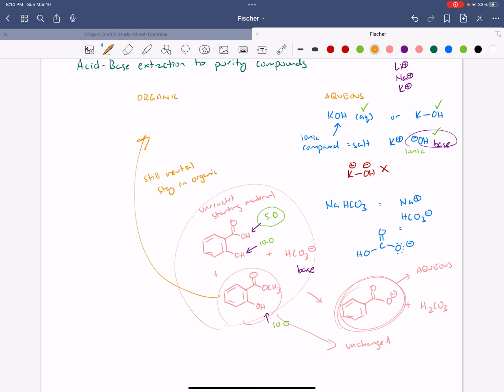In this case, our organic layer was dichloromethane. Was it? Yes, you added dichloromethane to your reaction mixture. And then obviously aqueous is in water. But what kind of water? Basic water with NaHCO3. I know it's a little bit scattered, but look where these molecules are going. Once it's charged, put it in the aqueous.